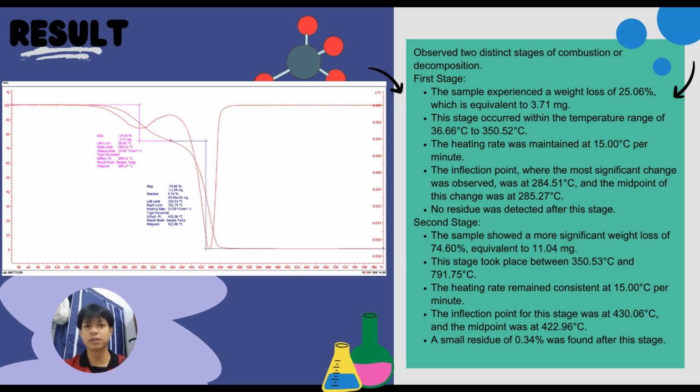This observation highlights the thermal stability and decomposition characteristics of the sample, providing valuable insight into its behavior under controlled temperature conditions.